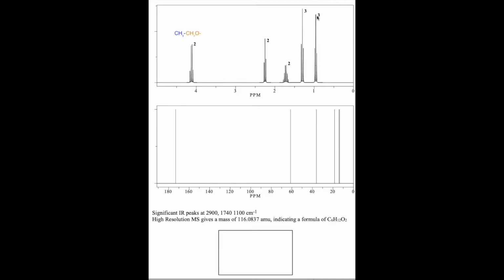So one of these two methyl groups here was this blue methyl group. So I have to look for that. It has to exist somewhere. But because I already know it's connected to this orange CH2, I'm just going to put a big X through it so that I don't accidentally incorporate it twice into the molecule. The orange CH2, that quartet at 4.1, the multiplicity allowed me to imply the existence of a CH3 that is a triplet. I have two of them, so I'm just going to wipe one of them out. Say, yep, I've dealt with you. I know exactly where you're connected.